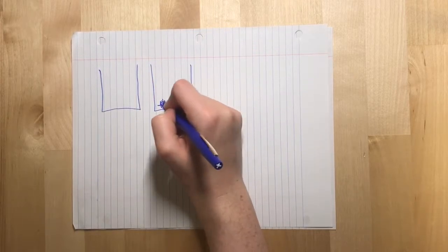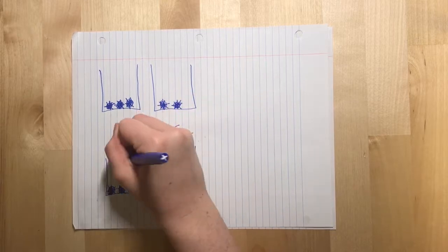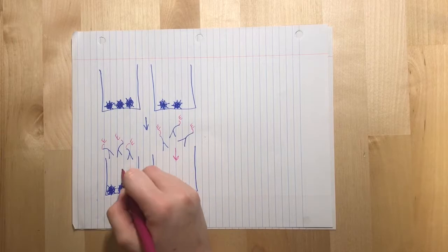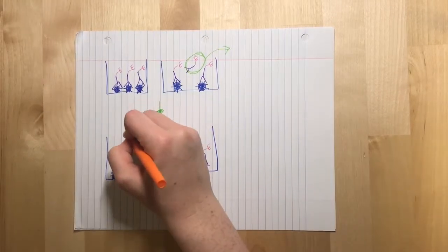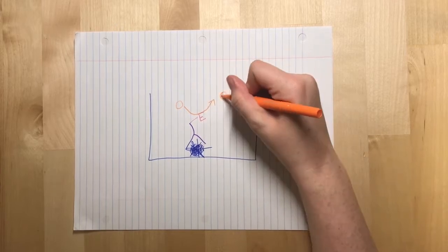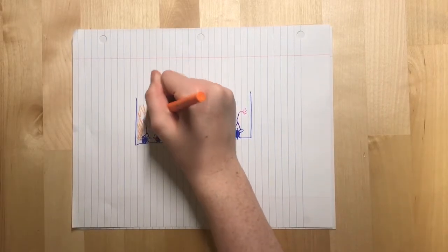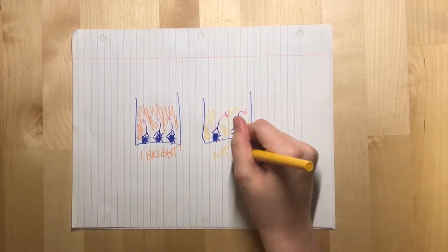The first step is to attach antigens to a surface. The next step is to add a specific antibody with an enzyme linked to it to the sample. Finally, we will add the substrate for the enzyme. The enzyme catalyzes a reaction of the substrate, which causes a color change to be visible. So overall, solutions with a greater amount of enzyme-bound complexes produce a greater color change.